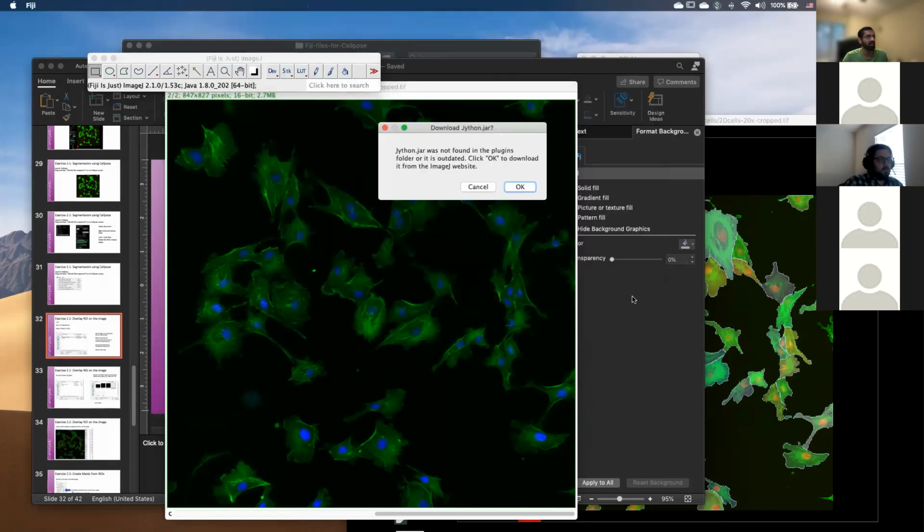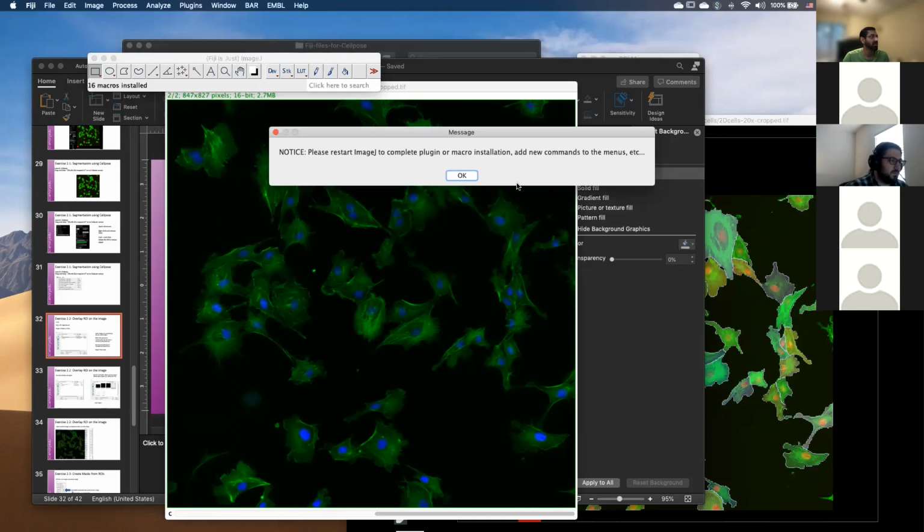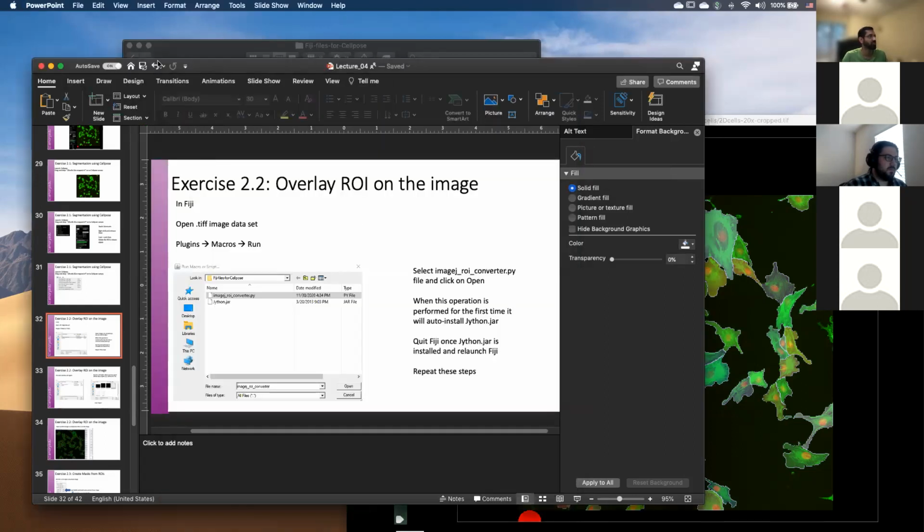So, well, it does tell me, so that's okay. I'm gonna say okay. It's gonna do the Jython thing, and it's gonna ask me to restart Fiji. I'm gonna say okay, which is great because we are all on the same page now.